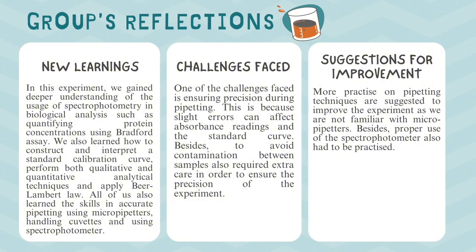So, the suggestion for improvement is that more practice on pipetting techniques is suggested to improve the experiment as we are not familiar with micropipetters. Besides, proper use of the spectrophotometer also had to be practiced.